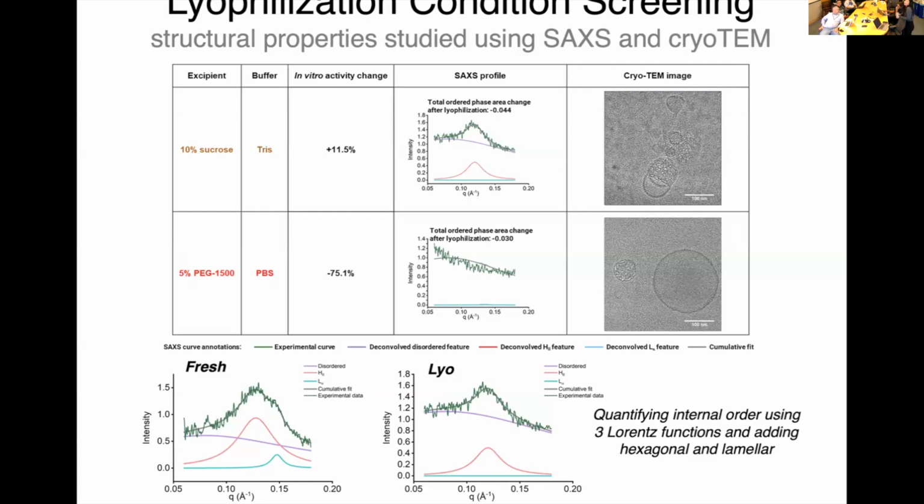So it does help to have cryo-EM next to it, but it is a lot lower throughput. So I mainly pick out the very representative particles, things that look very odd under scattering profiles, and then they'll run the cryo-EM for those, and then I usually can verify that what I was seeing in SAXS, what I was thinking was happening, is actually what's happening. It's just a confirmation thing. So it helps a lot in terms of throughput.